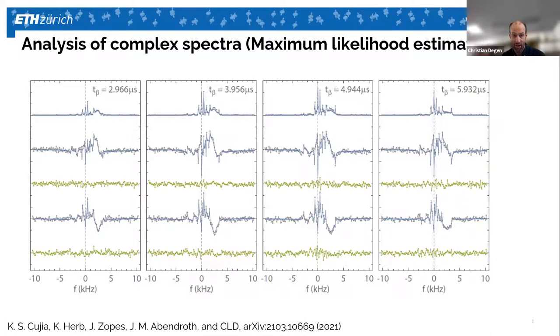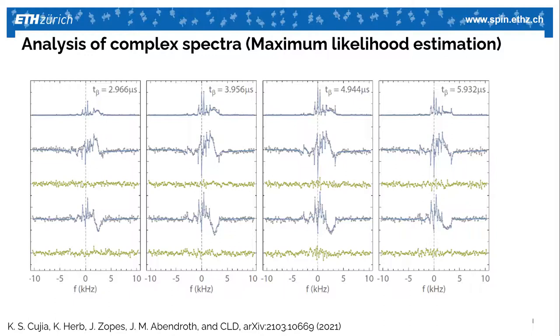So we phase shift. Every readout in our quantum readout is phase sensitive to the precession, and we shift the phase by 90 degrees between each readout. And then in the Fourier transform, it upshifts it such that you keep both components, but it will be the same as TPPI in indirect NMR. Mm-hmm. Okay, all right, yeah.